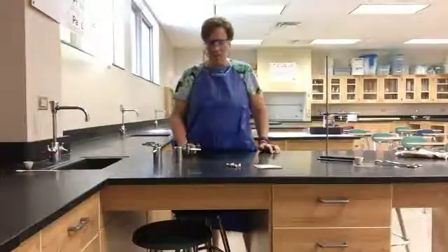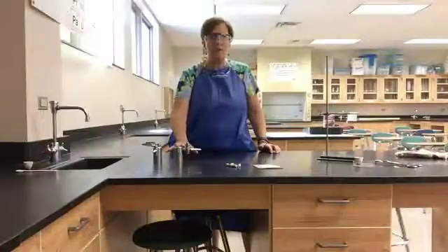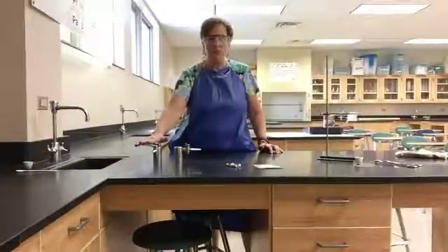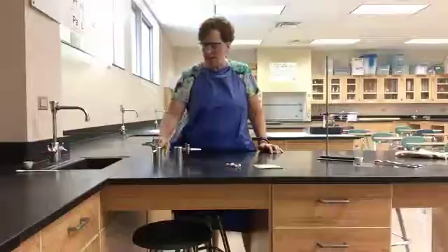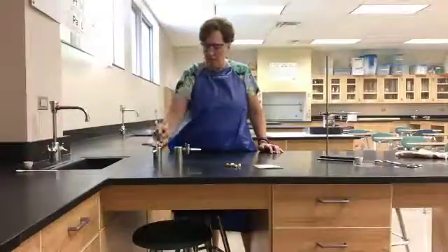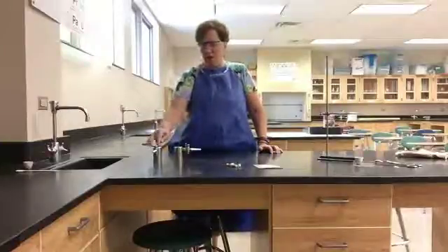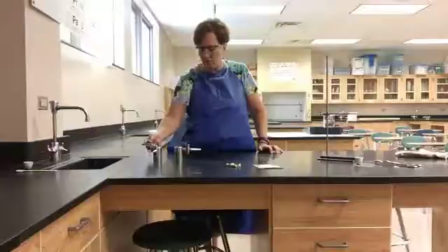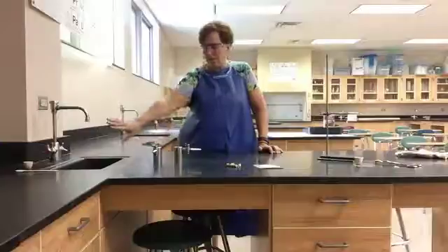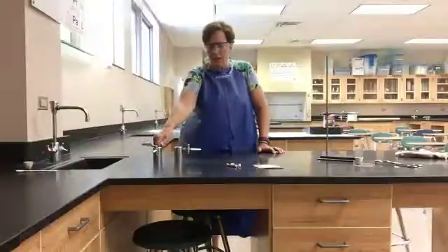Before we look at lighting the Bunsen burner, let's talk about the nozzles at the bench. The front nozzle is for air and it doesn't work, so don't worry about that. The two at the back are for gas. The gas has a nozzle and a handle — if the handle and nozzle are lined up together, the gas is on full blast. For the gas to be off, the handle must be perpendicular to the nozzle. If the handles are pointing directly at the sink, those are off.